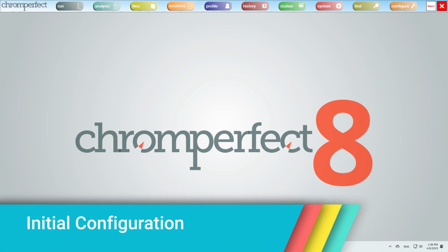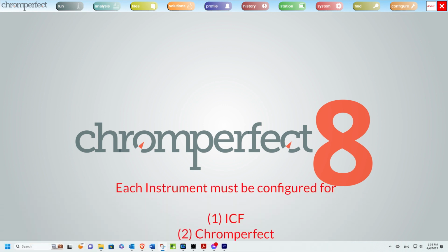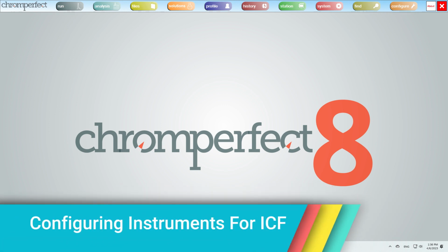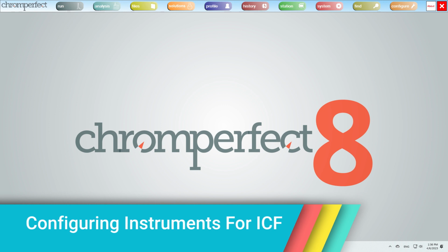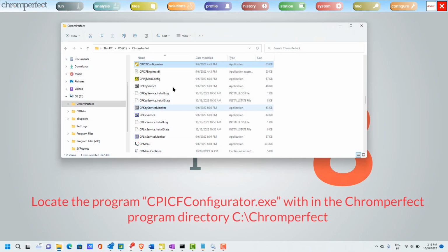Initial configuration. Once the files have been installed, there are two final tasks. Each instrument must be configured, first for ICF, and then for Chromperfect. Configuring instruments for ICF. In order to connect to an instrument, it must first be configured for ICF. This process generates a configuration file for the instrument. Once that is done, no further configuration will be required unless the instrument changes its internal hardware, or its IP address. To configure an instrument, launch the ICF configurator program.